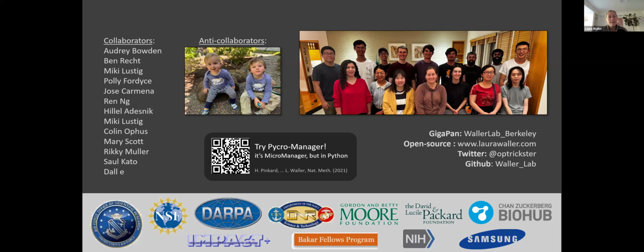So I think, like, the LED array stuff, certainly, what we found is DPC, this differential phase contrast, you don't get any super resolution, but you get quantitative phase. That is extremely robust. You can install the LED array completely wrong and it'll still give you a pretty good result. But for the Fourier ptychography, the super resolution, you need to have some sort of calibration step, either physically or with this algorithmic stuff, which just takes longer compute. But you can get it going.